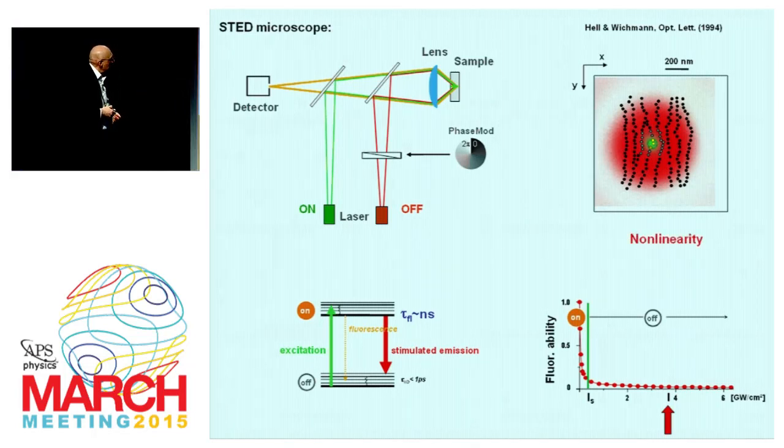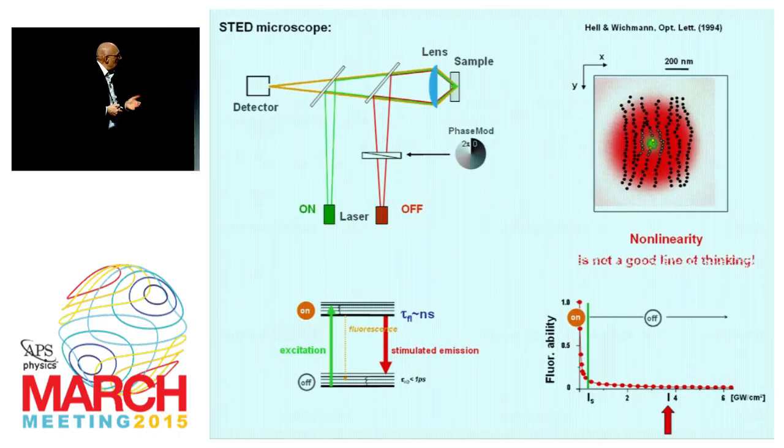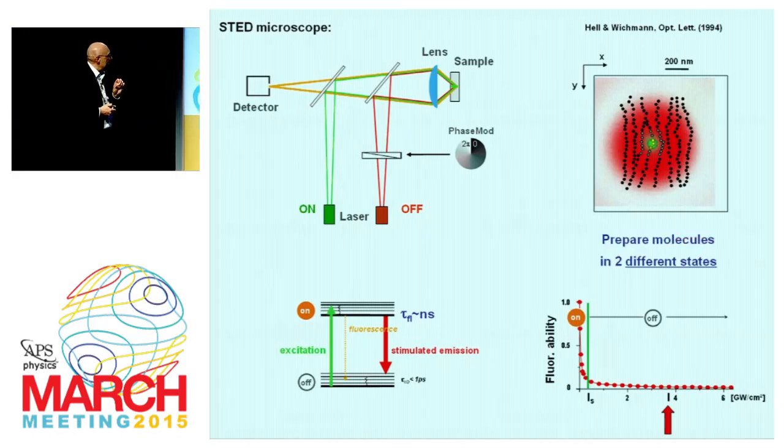Okay, now we can instantly agree on the fact that what we do in here is saturate. You can think about this as a nonlinear phenomenon that we use in here. But I'm warning you a bit. This is not a good line of thinking. The nonlinearity is not a good way of thinking. What actually happens is we prepare the molecules in two different states.